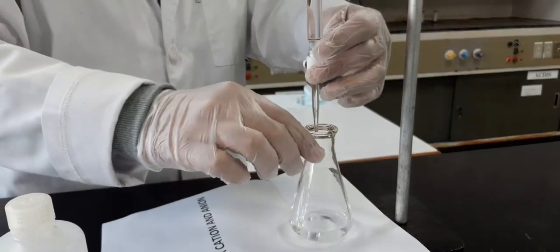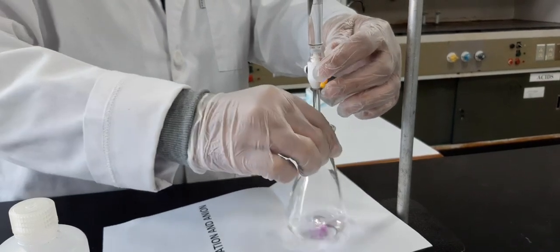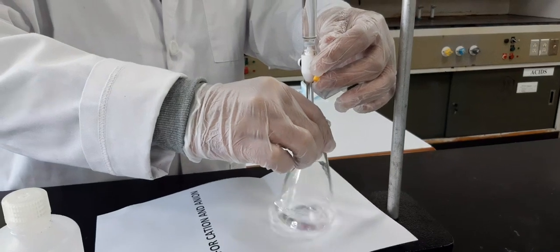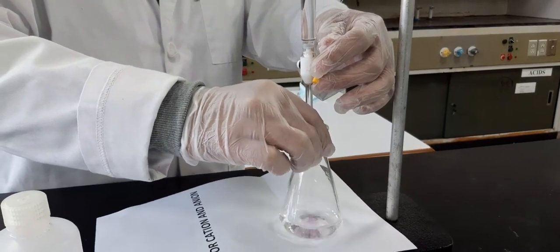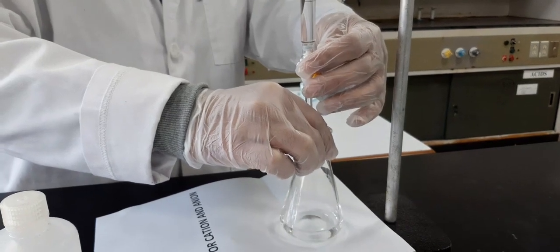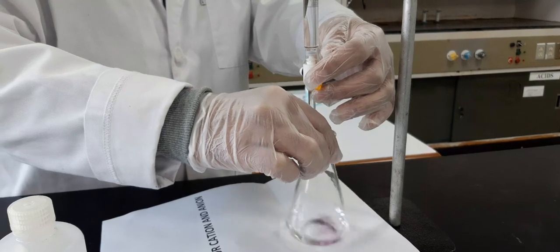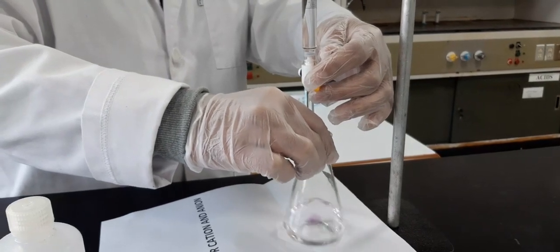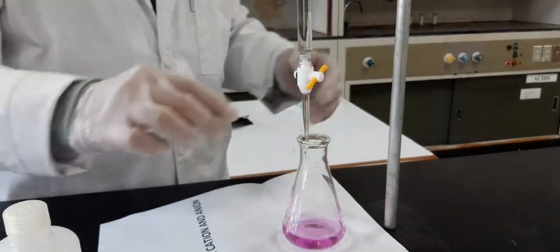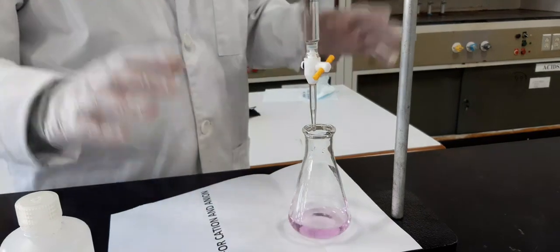So I can make it a little bit faster, but not too much faster. You cannot control it. Look at this, the color is there, and when I shake it, it disappears. It disappears again after shaking. That's why shaking is so important. When we get a permanent pink color, we will stop the titration, meaning we stop adding base from the burette. Now you can see this is a pink color. So this is our end point.